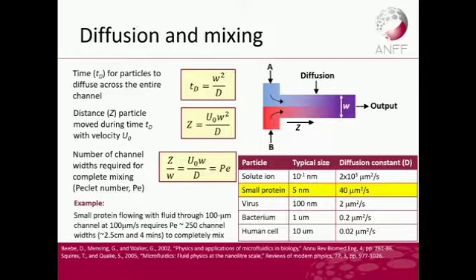Here we're still on diffusion, but instead of just looking at one-direction flow, we can also look at the length of channel that is required for full diffusion of the particles.